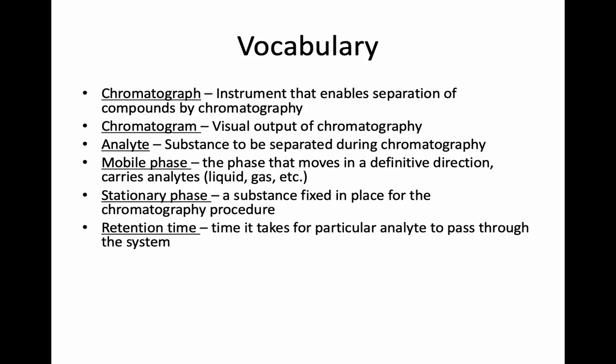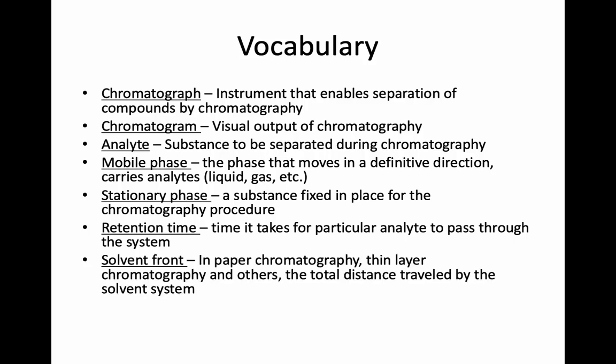We define the term retention time as the time it takes for a particular analyte to pass through the system. And the solvent front: when you will see next a very simple and rudimentary chromatography experiment called paper chromatography, the solvent front is the layer of your solvent, right? It's the top front of your solvent or your mobile phase as it moves across the chromatography column.